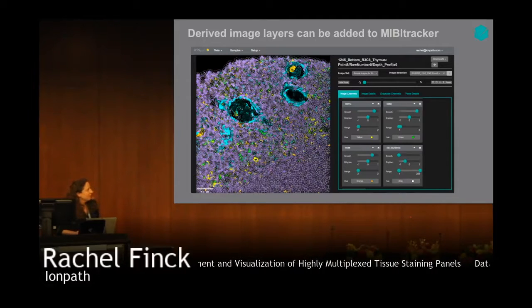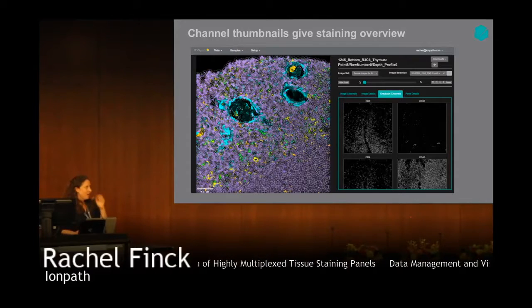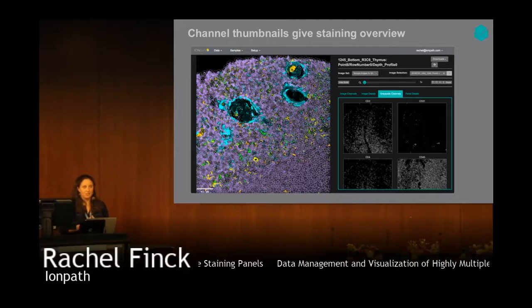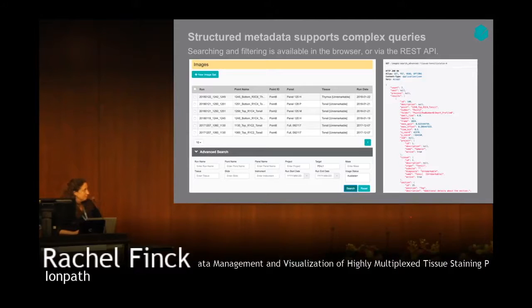Another thing is other useful snapshots. The kinds of plots maybe aren't hard to make, but if you have to make them from scratch each time to do your sanity checks, to do your QC, it can be cumbersome, and we're just trying to provide them as a tool.